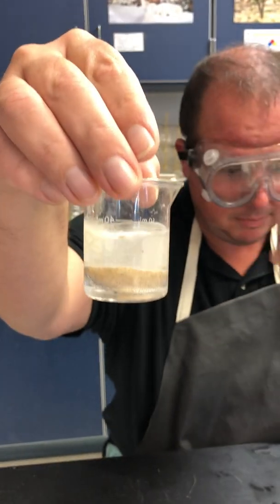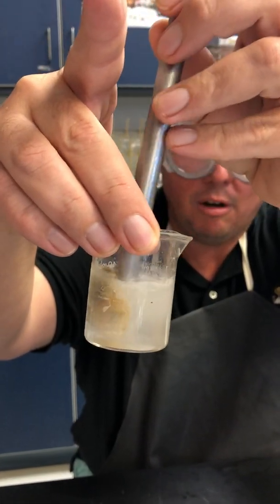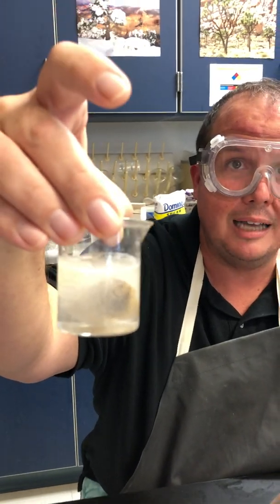If I stir it a little, notice all of those bubbles and how cloudy it's getting. So what that is a clue to us is there's a chemical reaction.